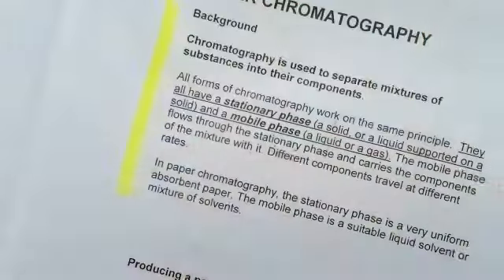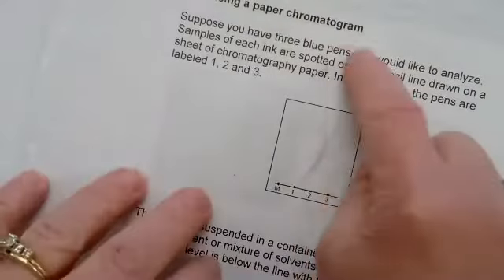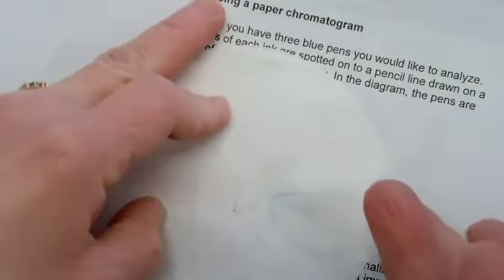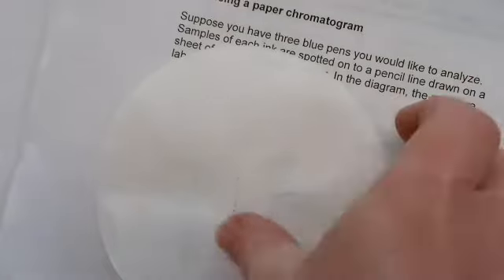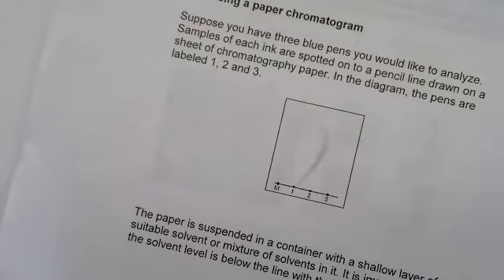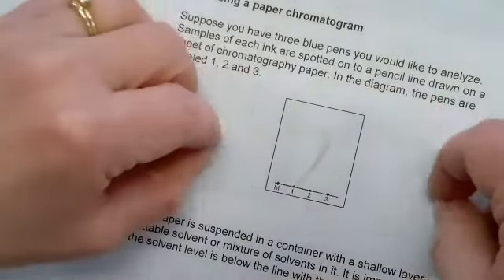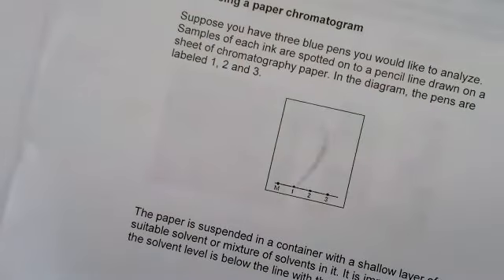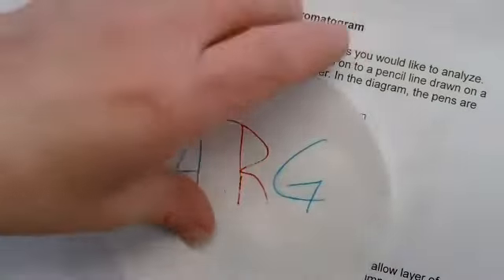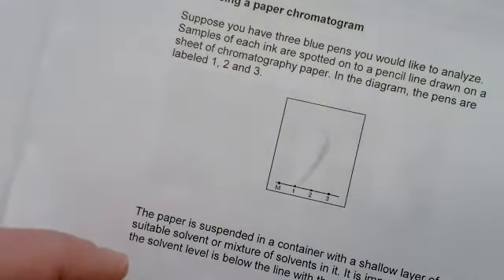And we ended class with this yesterday. So today, we are going to use polar paper. That'll be our stationary phase. It's very similar to the filter paper. It does get a special name, chromatography paper. You'll see ours is a bit more rectangular just because of the testing that we're going to do. We are going to be a lot more purposeful and disciplined in how we prepare our samples instead of just writing our initials, and actually collect some measurements with it.